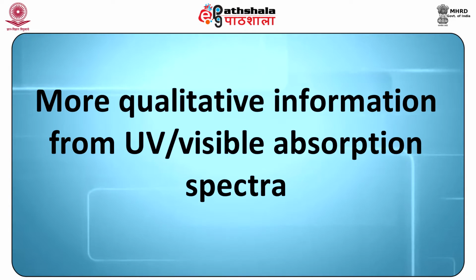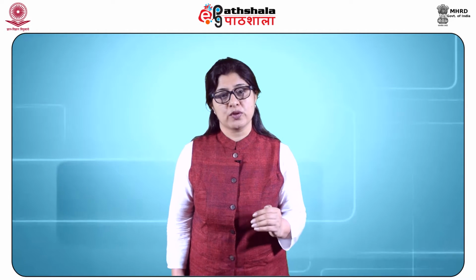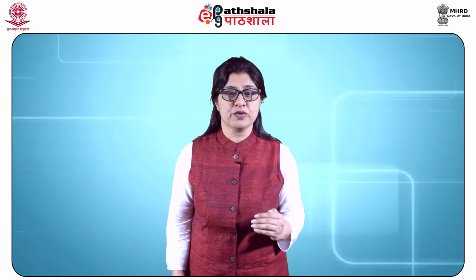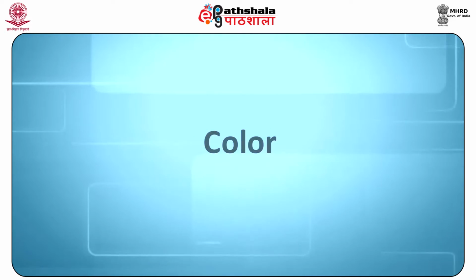More qualitative information from UV visible absorption spectra. UV visible spectroscopy can also be used to determine the physicochemical properties of a compound, which provide useful qualitative information about that compound. This can be done in the following ways. Color.